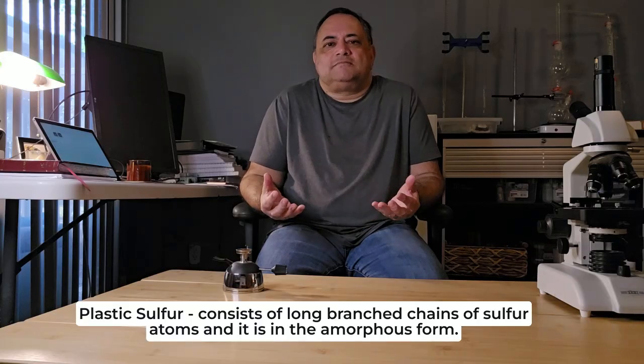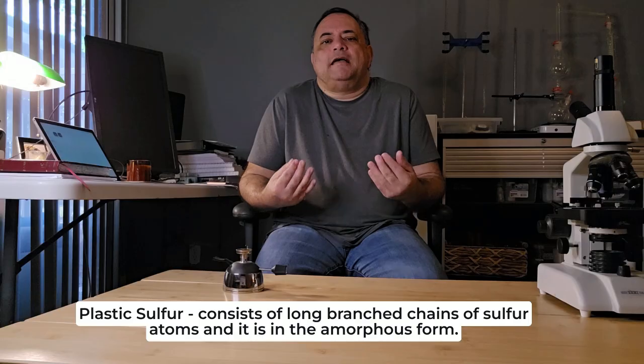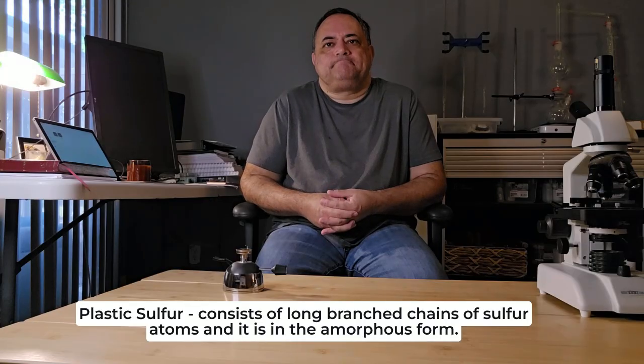In the second part of the experiment, we also heated sulfur in a test tube, but we heated it a little bit longer because we were looking for a dark red color. Once that color appeared, we then poured the sulfur into a beaker of water. And this formed plastic sulfur because it looks rubbery plastic. This plastic sulfur is formed, as we demonstrated, by the rapid cooling of molten sulfur.